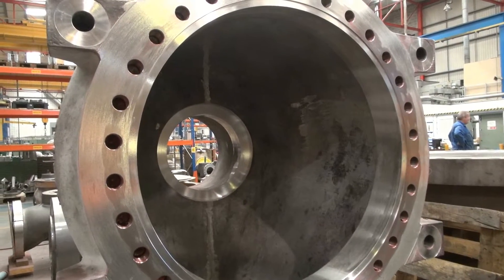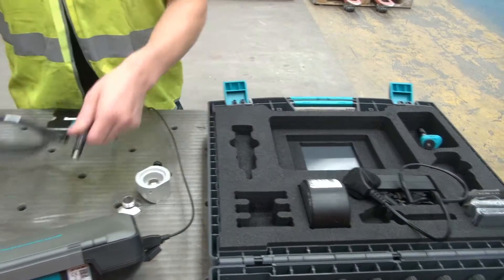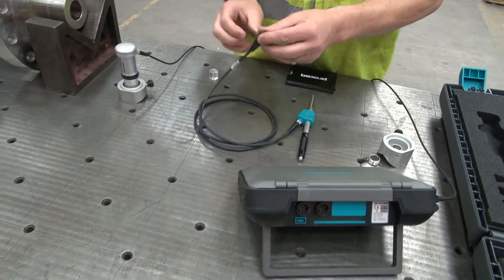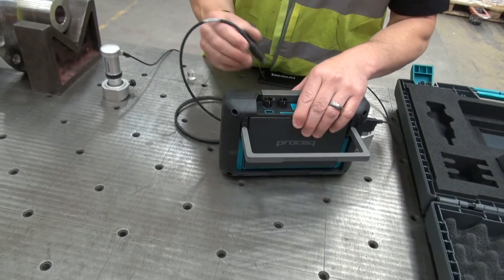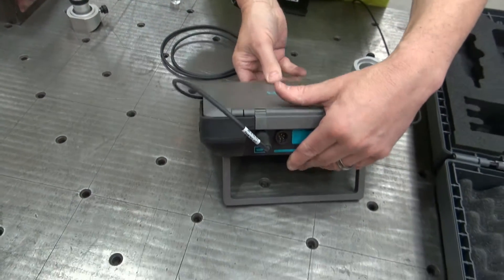Hello and welcome to this tutorial video. Surface preparation is a critical factor when it comes to hardness testing. I'm going to show you how to correctly prepare your surface using the tools available in your Recordtip 550 package.